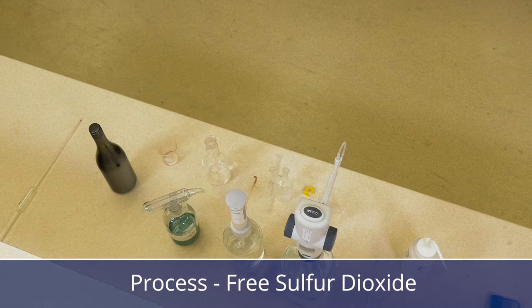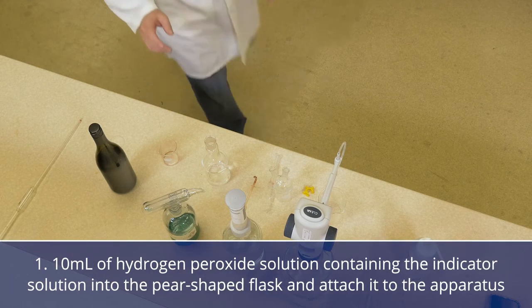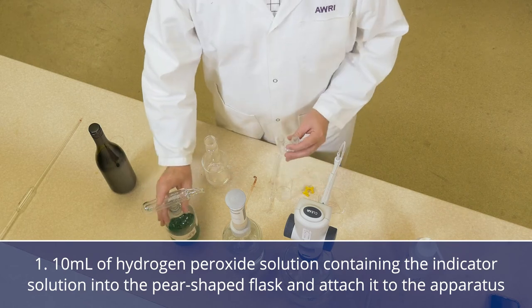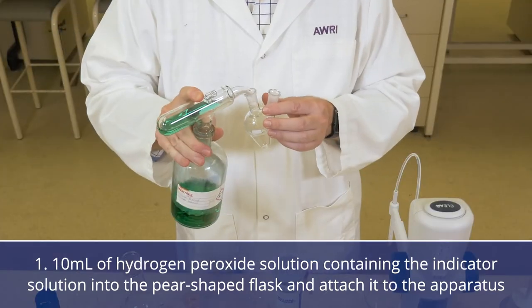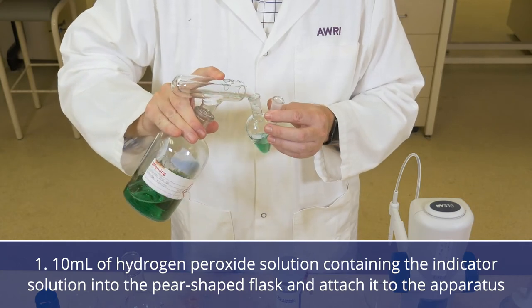This is the process for measuring free sulfur dioxide. The first step is to put about 10 mL of hydrogen peroxide solution into the pear shaped flask and then attach it to the apparatus.